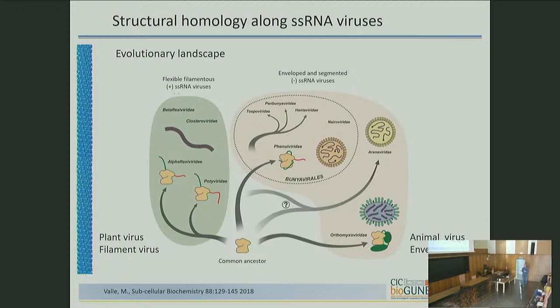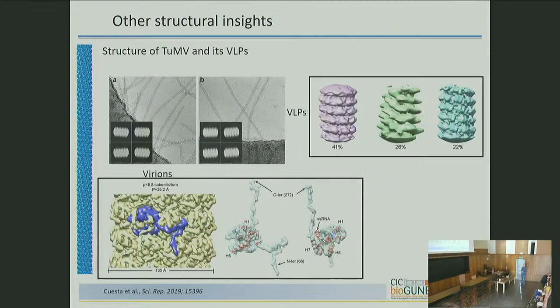So they don't have a lot of margin to change their structure and explore other possibilities. Other work we have been doing, for instance, is with turnip mosaic virus. This is another Potyvirus. One of the main reasons was to see whether this signature, the presence of the N-terminal region that bridges within the turn and between turns, was a signature of Potyvirus, and it turns out to be the case. The Potyviruses have this double staple.